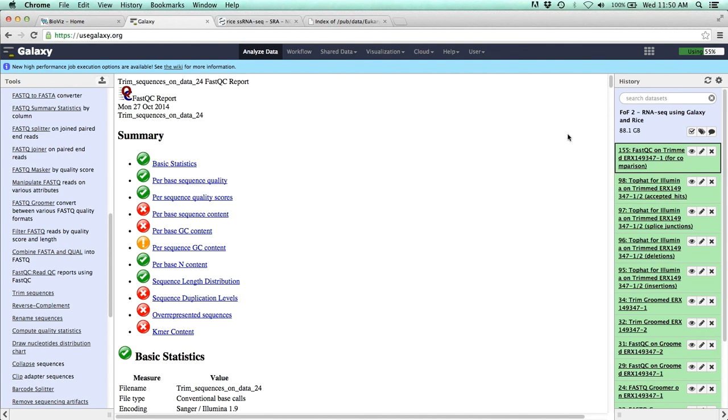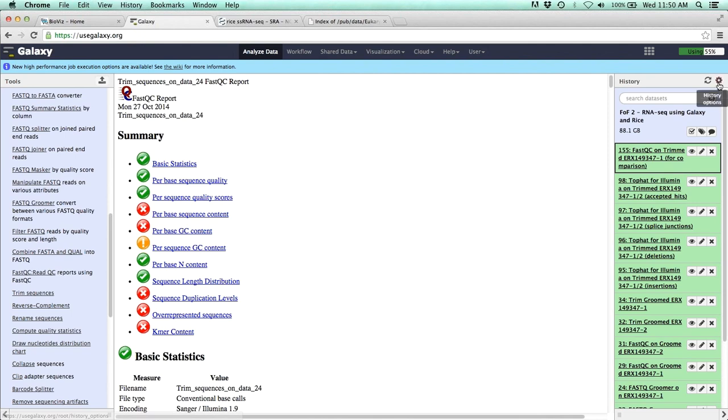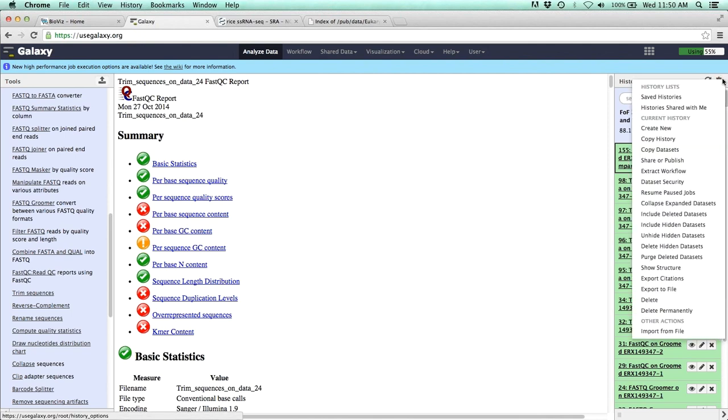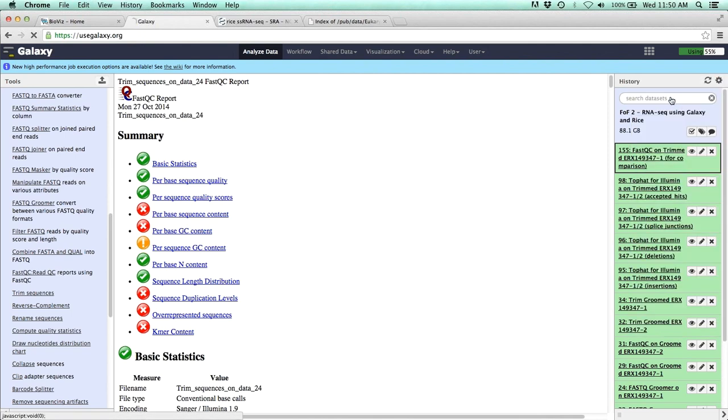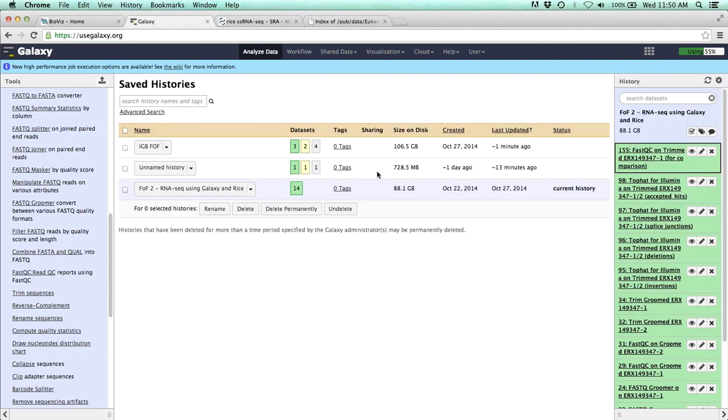So at this point, we've been able to import our data, set up our genome, we've groomed our data, we quality checked our data, and we actually will say we improved our data a little bit by trimming off the poor sequence at the end of the read. So now we're finally ready to actually do the alignment.